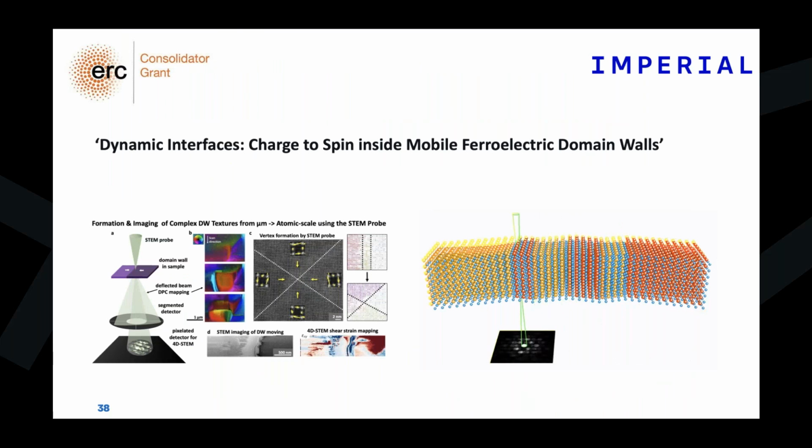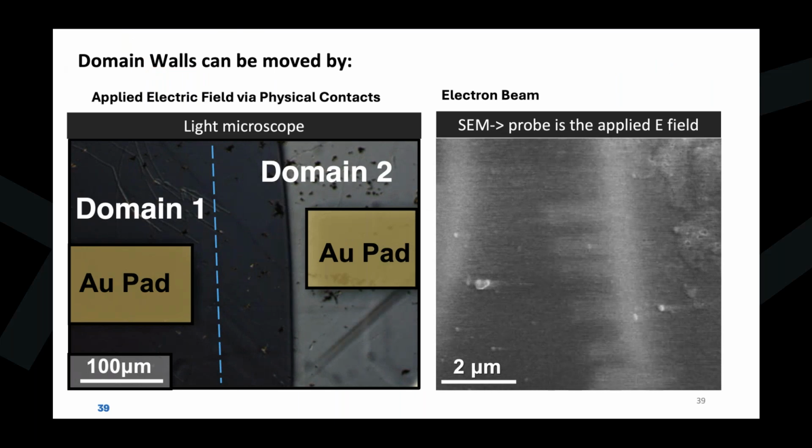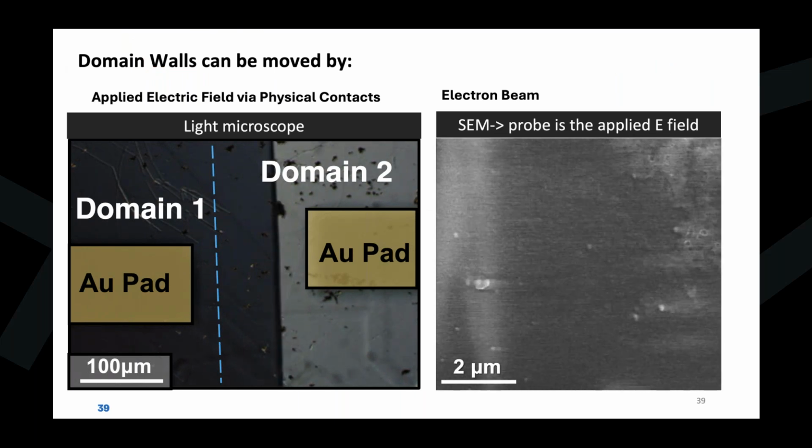Okay, so I've talked a lot about that, but we were really only at the start, and that's why we got lucky. That's also funding Mariana's work as well, where we were able to really probe this and see experimentally, can we pick this up? So we started a lot of this work a couple of years ago, where we did light microscopy, SEM. Back then, I couldn't move the electron probe around in different directions.